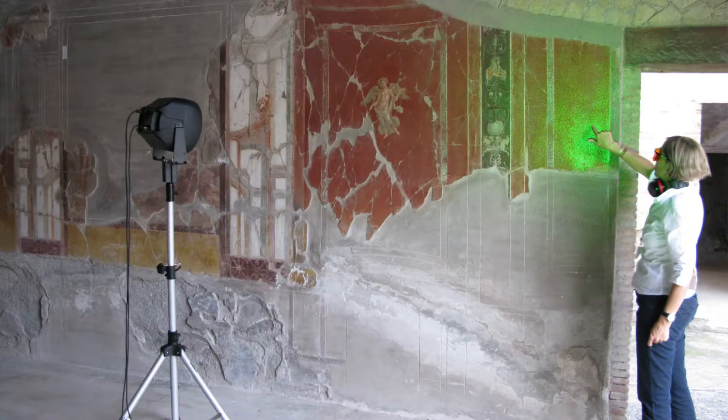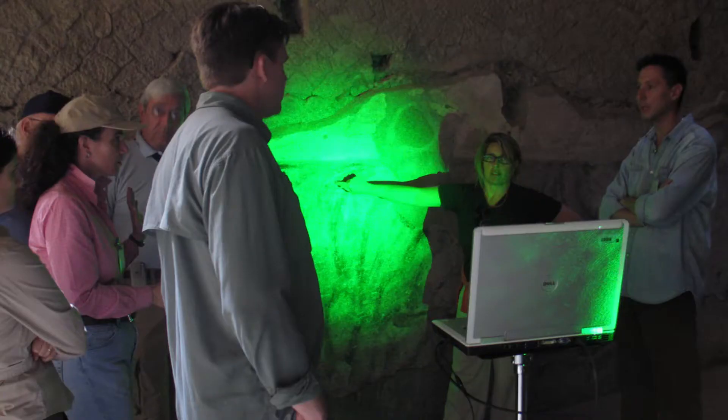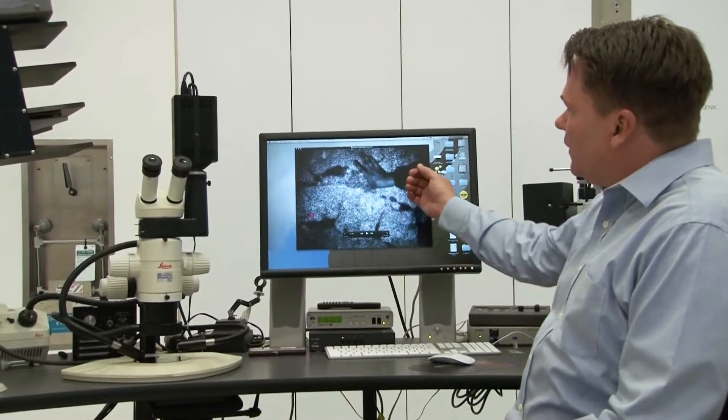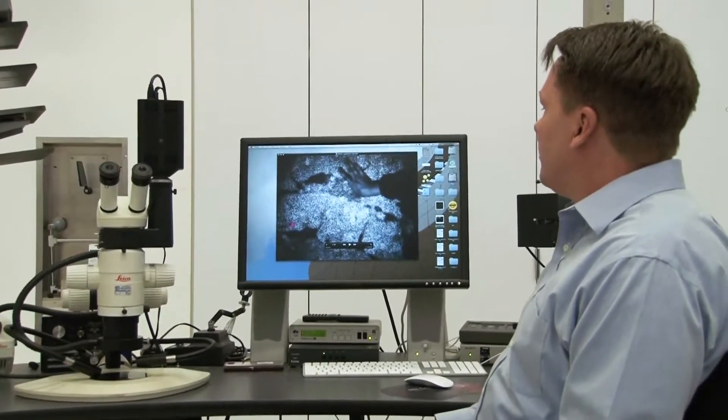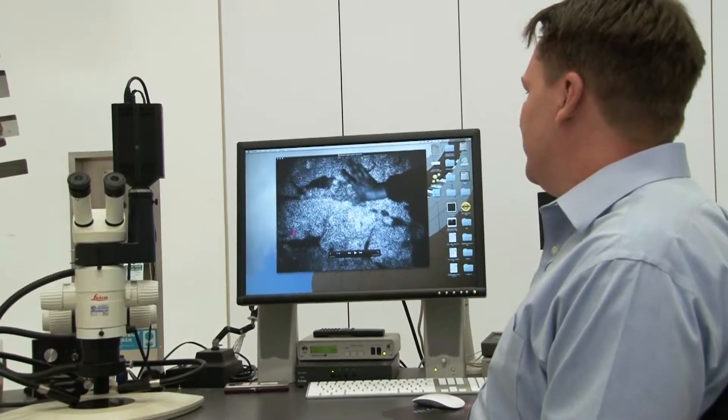it interferes with itself. And when it interferes with itself, it creates a pattern which we can see here on the screen. A bright speckle is a positive interference, whereas a dark speckle is negative interference.